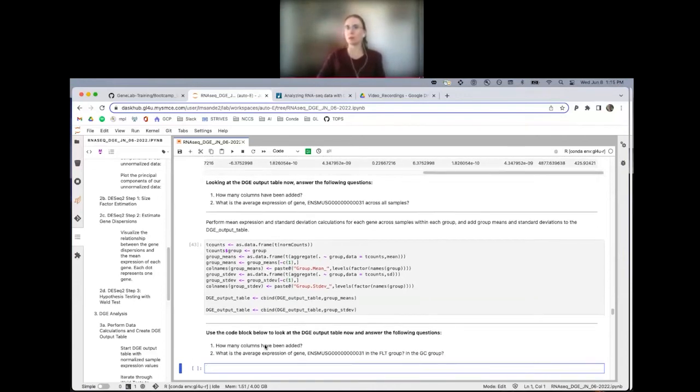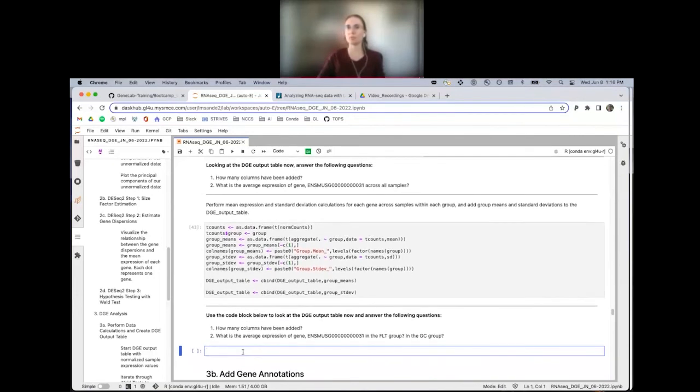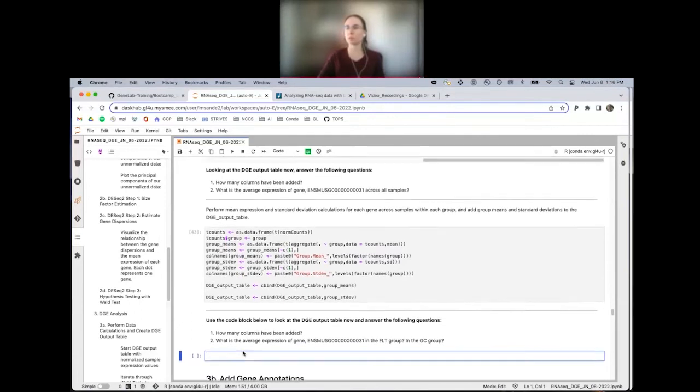All right. Let me know when yours finish. In the meantime, let's just do these questions together on my screen, since I don't know how long this is actually going to take on your end.